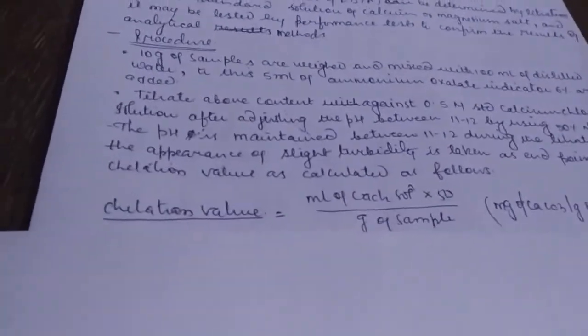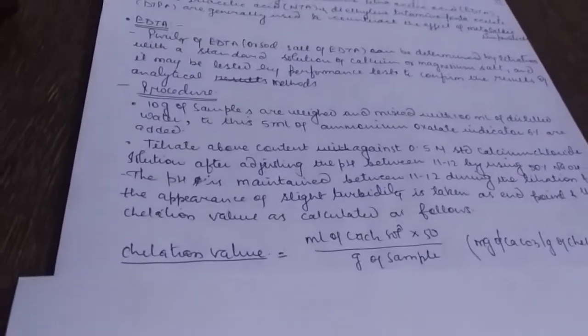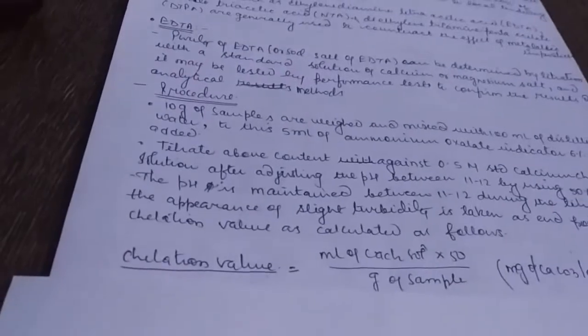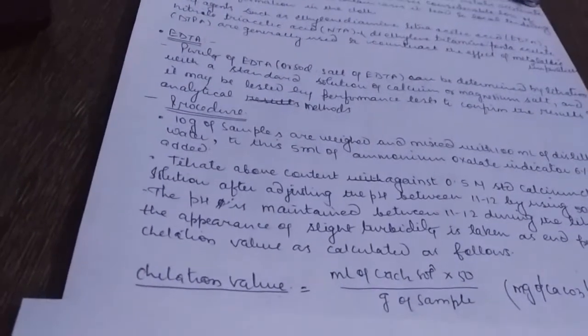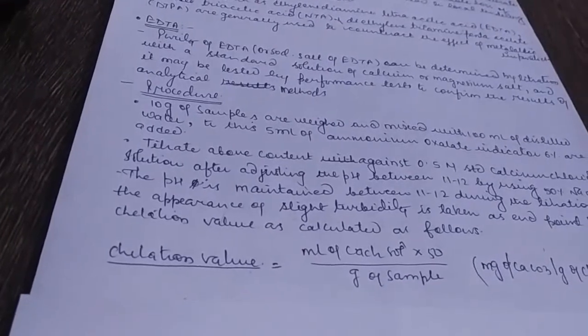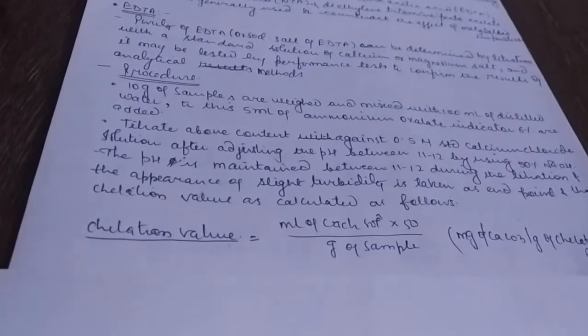In this way we can calculate the chelation value, that is, ml of calcium chloride solution into 50 divided by grams of sample. Chelation value means the capacity of any sequestering agent to form a complex with the water hardness.